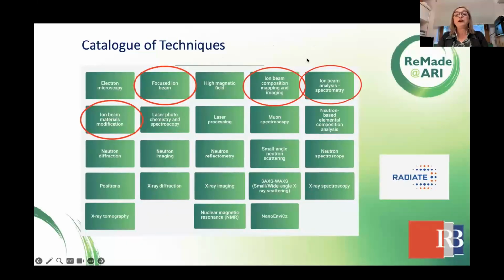If you visit the website, you will see there is a catalog of techniques, and those related to ion beams are placed in four folders: ion beam analysis spectrometry, ion beam composition mapping and imaging, focused ion beams, and ion beam material modification.